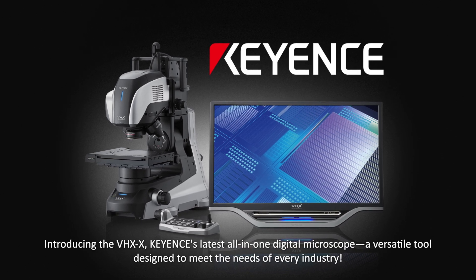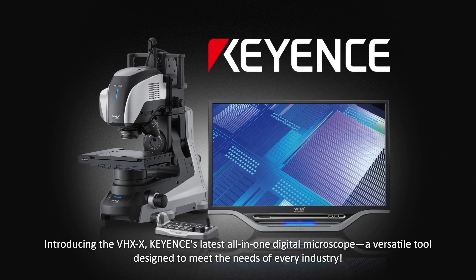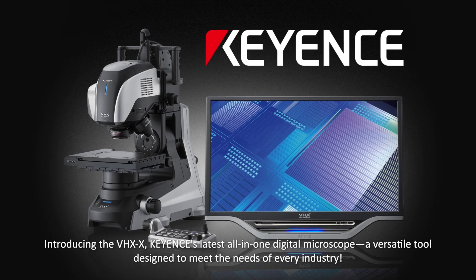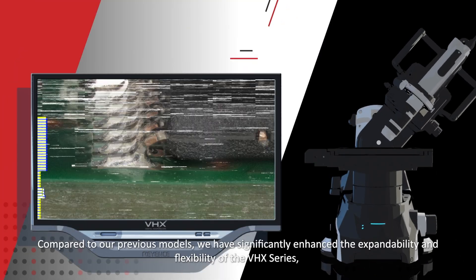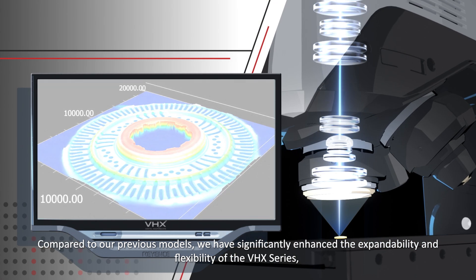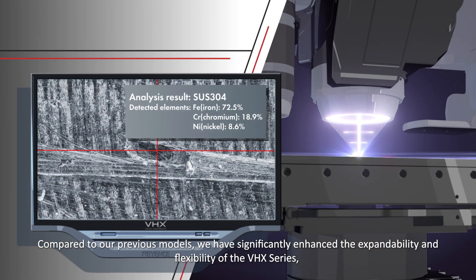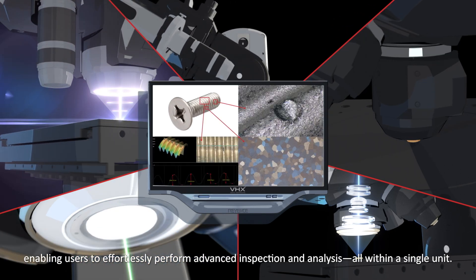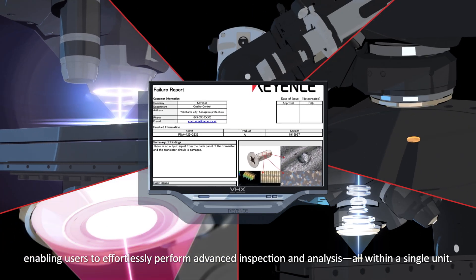Introducing the VHX-X, Keyence's latest all-in-one digital microscope — a versatile tool designed to meet the needs of every industry. Compared to our previous models, we've significantly enhanced the expandability and flexibility of the VHX series, enabling users to effortlessly perform advanced inspection and analysis all within a single unit.